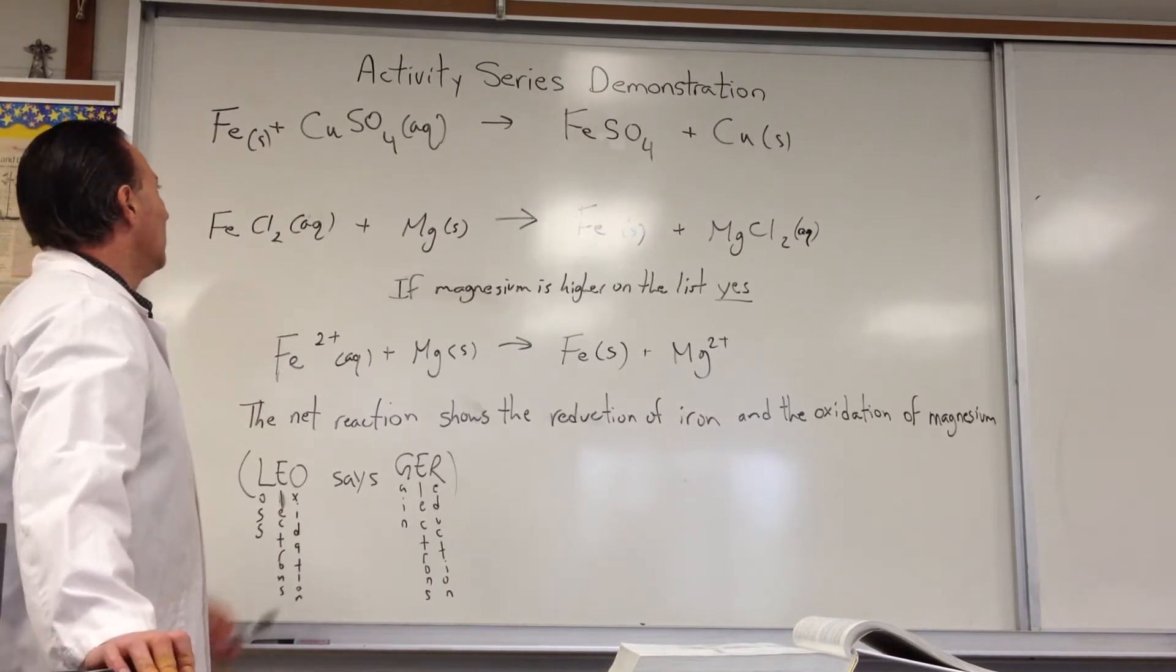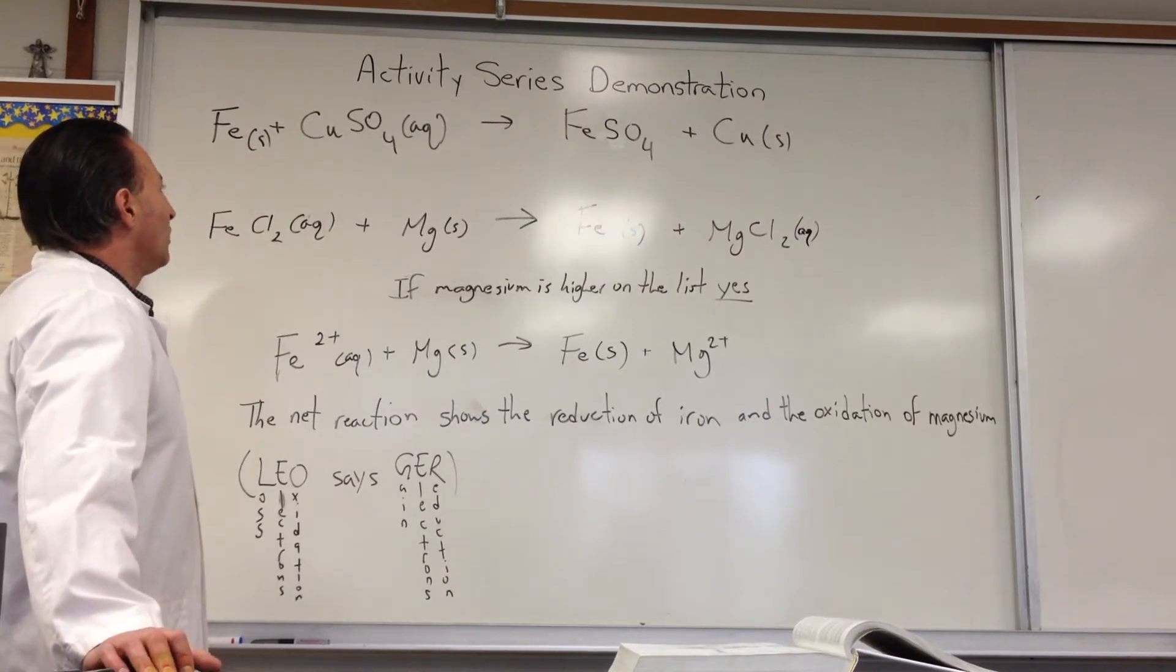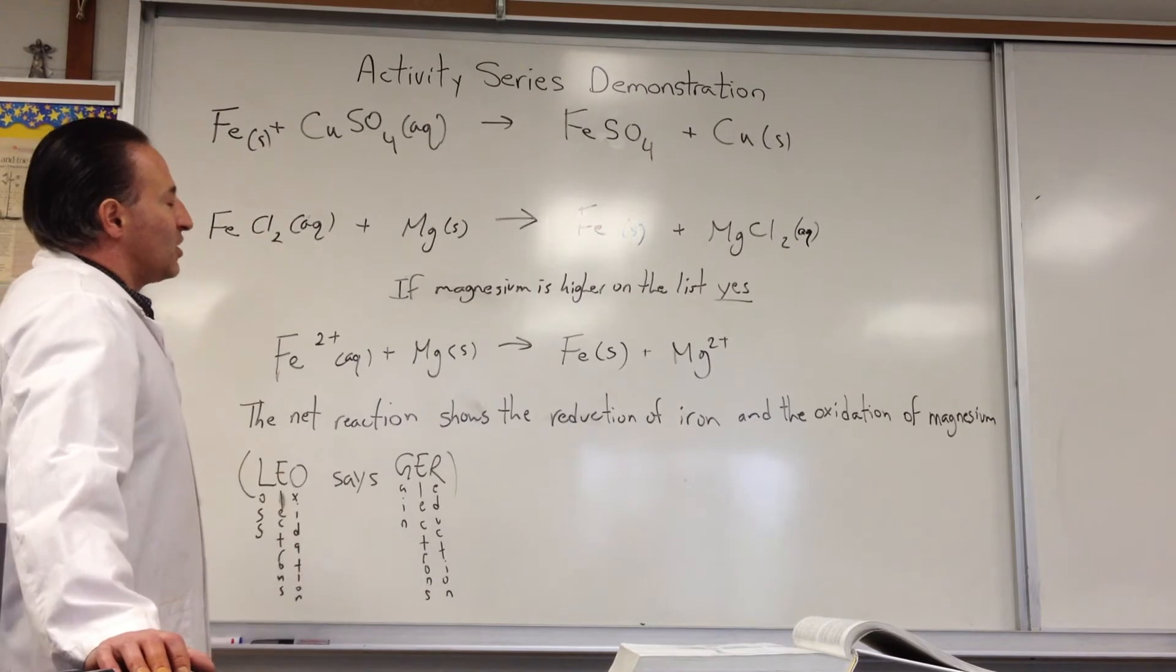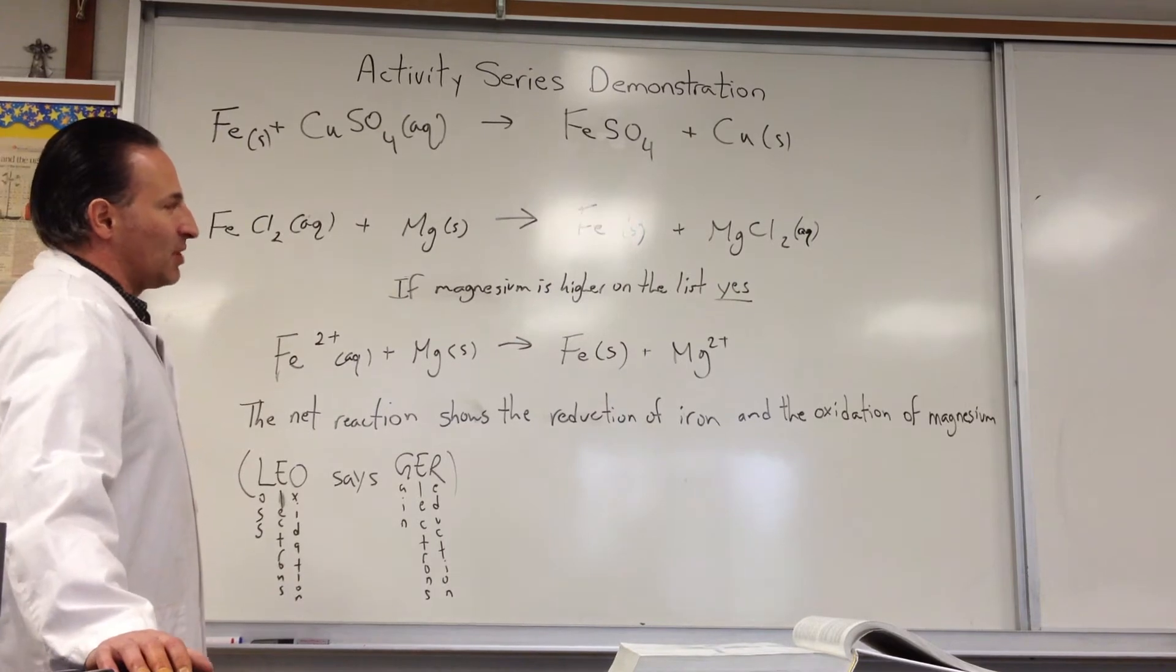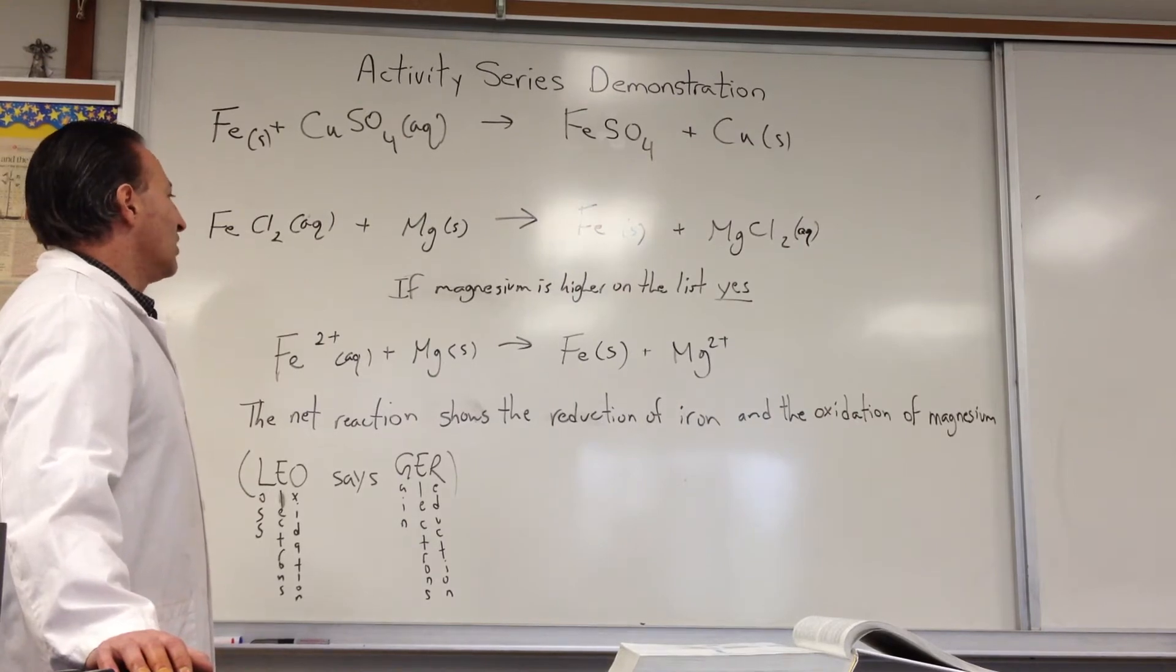We'll see from the experiment that iron has a higher activity than copper because iron will force copper to take its electrons, resulting in the formation of the ferrous ion, whereas copper will accept electrons and become solid copper. We'll see metallic copper appear in the reaction.